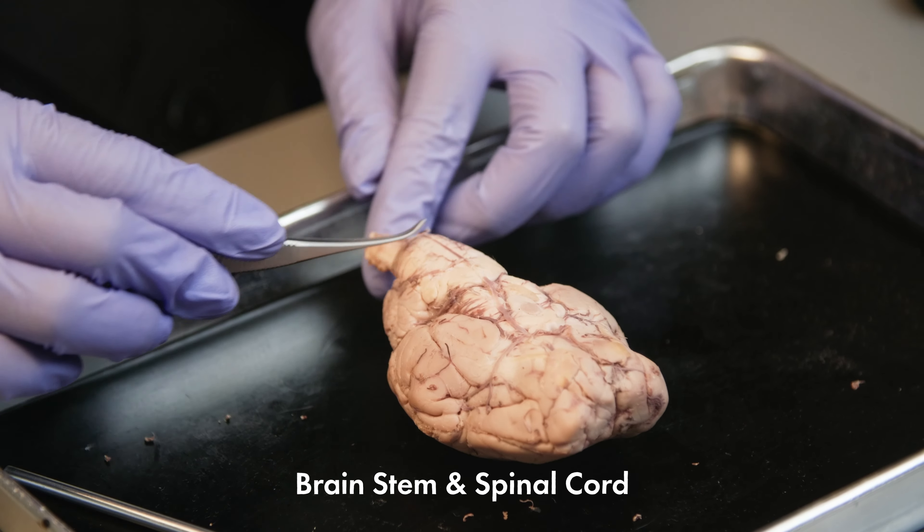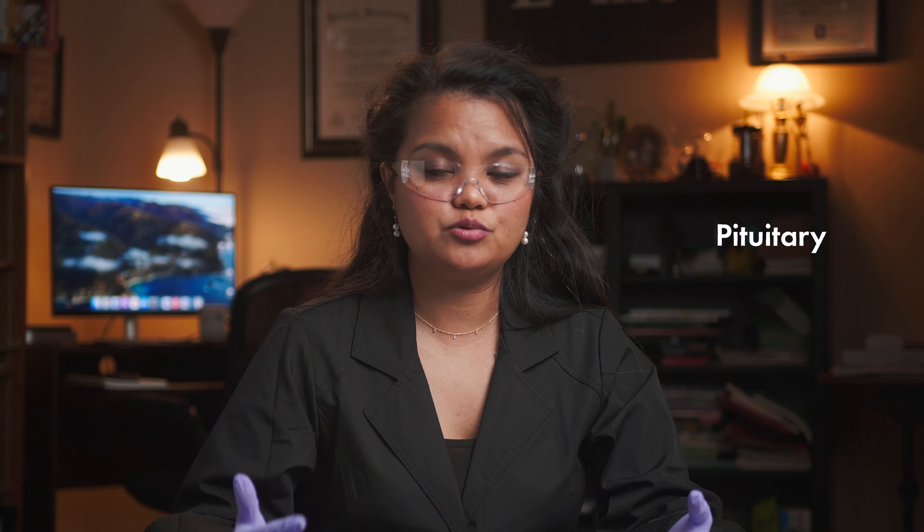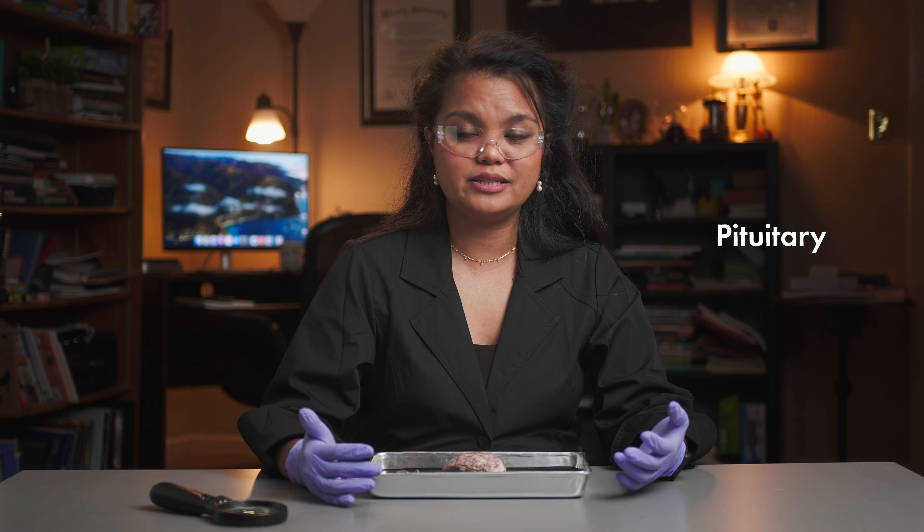When the brain was removed from the skull, the cranial nerves and the pituitary were cut. There are 12 pairs of cranial nerves, and these nerves send signals to the brain for smells, vision, eye movements, face movements and expressions, taste and swallowing, hearing and balance, abdominal organs, and many more. The pituitary controls hormones, reproduction, etc. It is the master of the endocrine system.